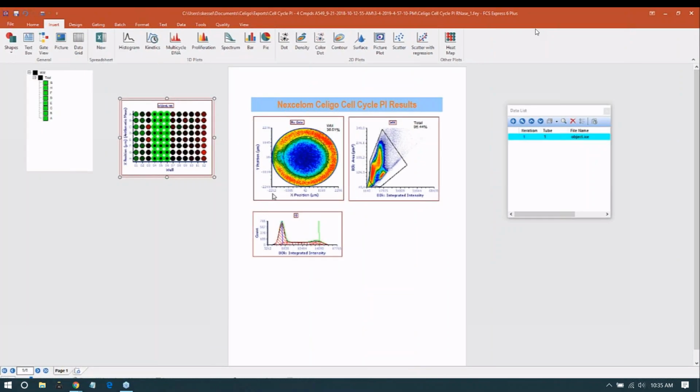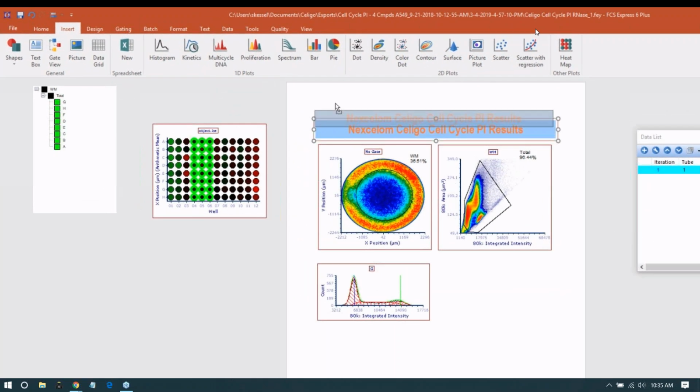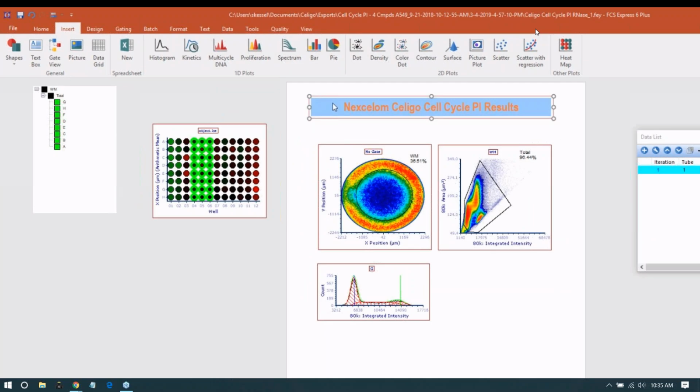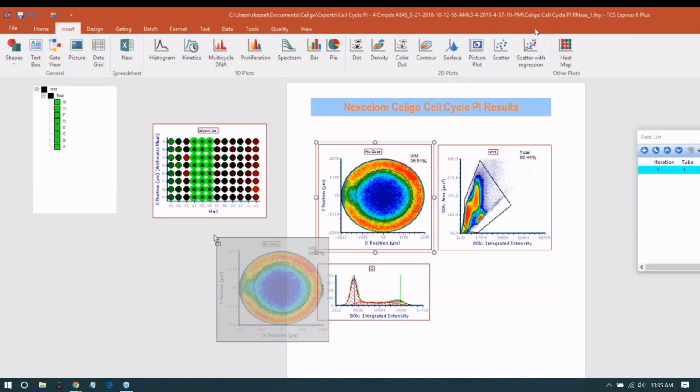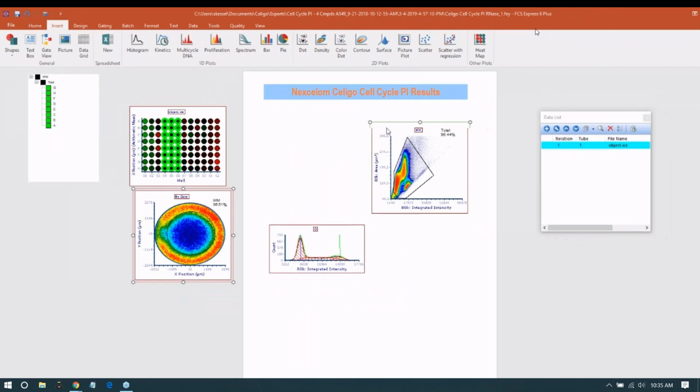So when it opens, this is what it looks like, very similar to what we created, but I had added a couple more replicate and wells for the dose response. So if you guys are interested in having templates, I can either send you the ones that I've made or can help you make one.